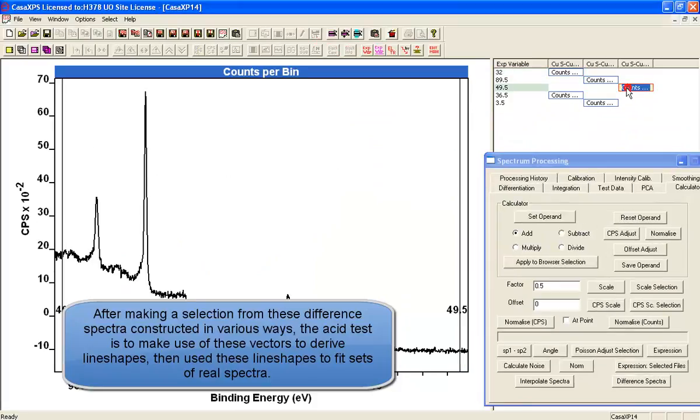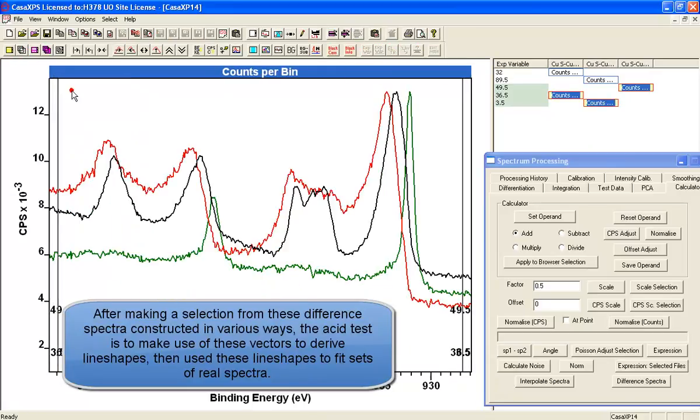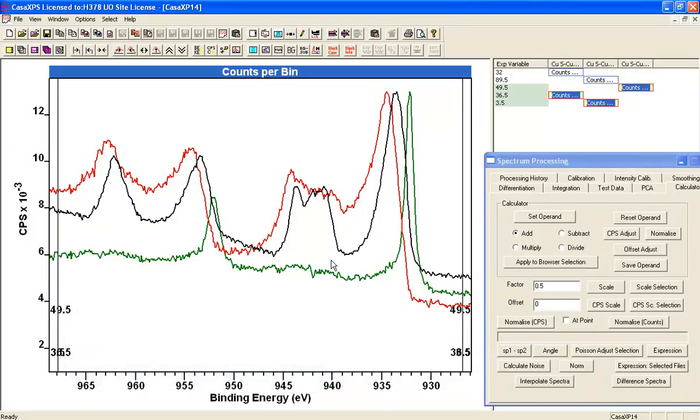So we've got here the copper 1+, and these are our first approximations based on different spectra using the particular samples in question for giving me line shapes from the data that we can now fit back to the original data, namely all the different TM samples that were measured previously and in the original file.